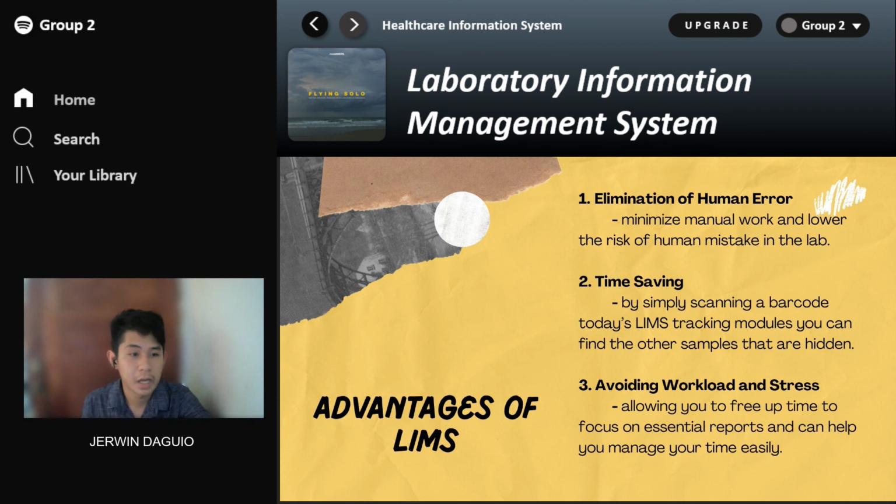Number 3. Avoiding workload and stress. The modern LIMS today have the power to transform the functioning of the laboratory by providing greater control, which is needed in the future. It is also convenient to everyone. For example, if the doctors are manually approving every report, it can take them a lot of time. With the help of this LIMS, or the Laboratory Information Management System, you can manage your time appropriately and properly.